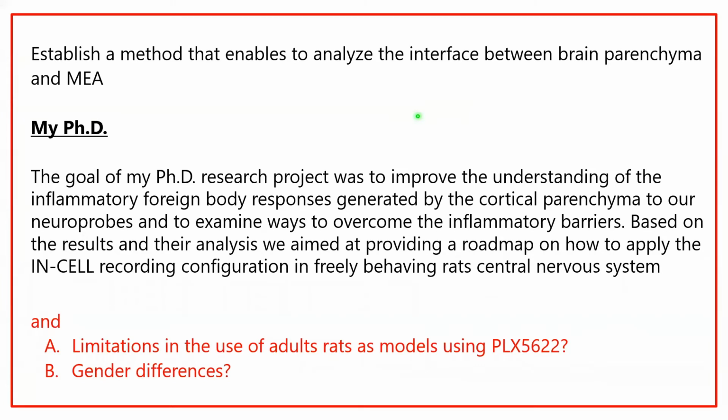I will talk about the establishment of a method in our lab a few years ago that enables us to analyze the interface between brain parenchyma and our neuroprobes. And I will talk about my PhD, which aims to improve the understanding of the inflammatory foreign body responses generated by the cortical parenchyma to our neuroprobes, and to examine ways to overcome the inflammatory barriers. Based on the results and their analysis, we aimed at providing a roadmap on how to apply the in-cell recordings configuration in freely behaving rats' central nervous system.